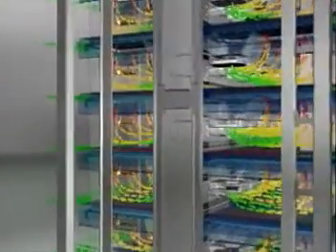Allerzone provides the best of both worlds: a positive cage in a negative rack with allergen control. Now you can eliminate the decision of whether your cages should be positive or negative with respect to the room.